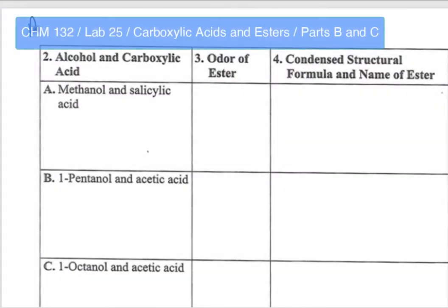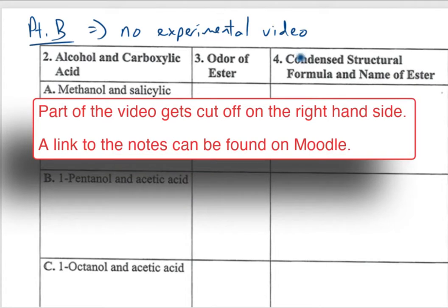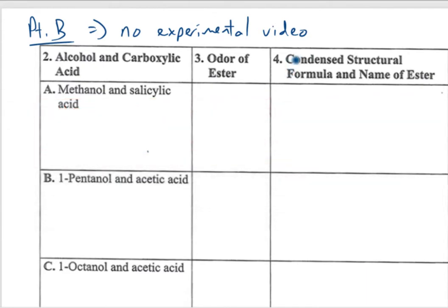So for part B here, there's no experiment, no experimental video. A couple reasons for that. There's really not anything to see, honestly. I mean, a lot's going on chemically, but you start with clear and colorless solutions and you end with clear and colorless solutions. So again, not much to see.